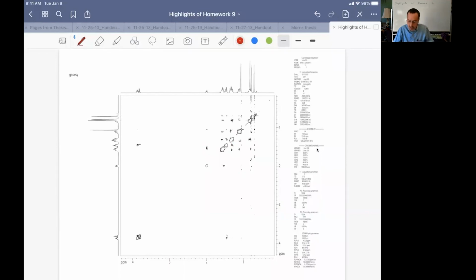And then you're going to turn to your NOESY spectrum, and you're going to start to figure out your various cross peaks, 2A and B with, I'll say, cross 11E. Here's a teeny tiny cross peak, barely perceptible, for 2A with 12H.